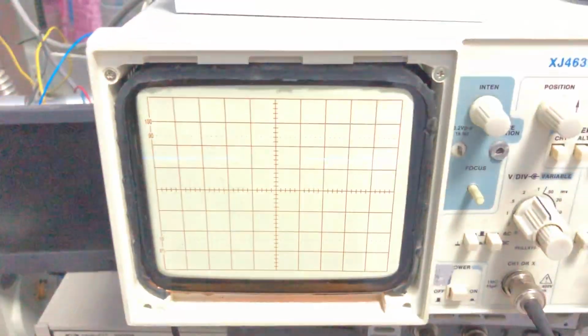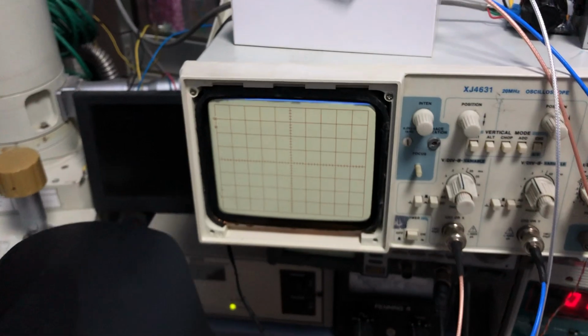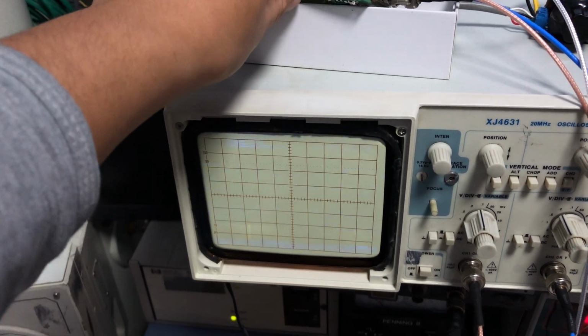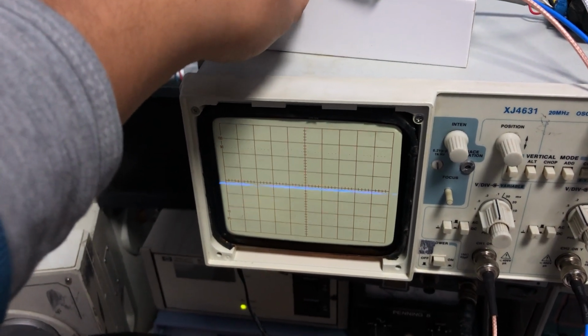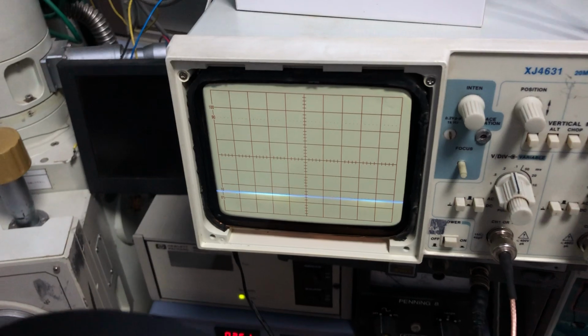So now you can see. Okay, let me turn on the light. Okay, here you can see the scanning line is building up the image. Here is the control mode that I can choose. Picture mode, slow. Oh no, this is TV mode. Slow picture. Yes, the slowest scanning speed is the picture mode.